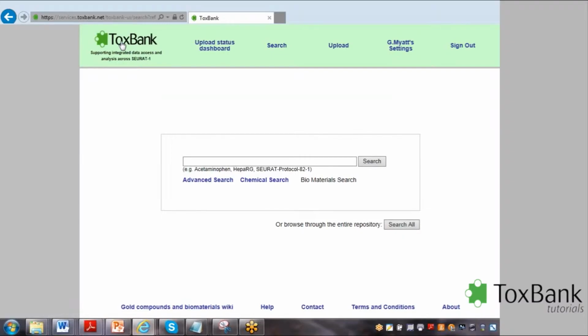So in summary, what we just did is to upload some preliminary data. We did in this case assign it to a case study. The status of the investigation was that the unformatted data had been uploaded. That data is then available to the cluster to review.